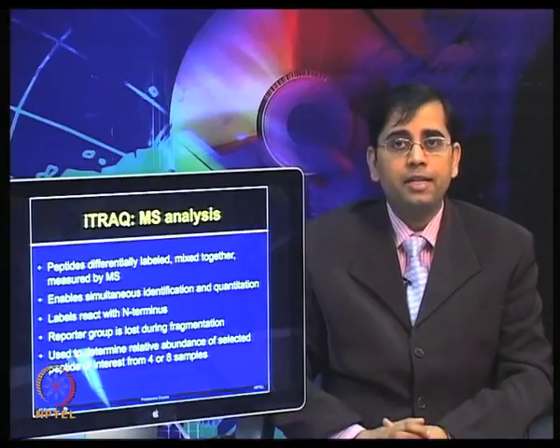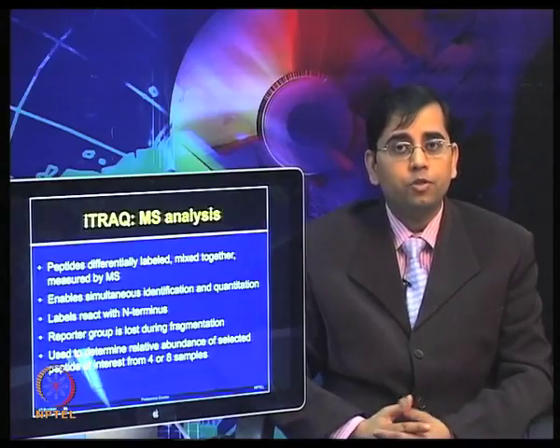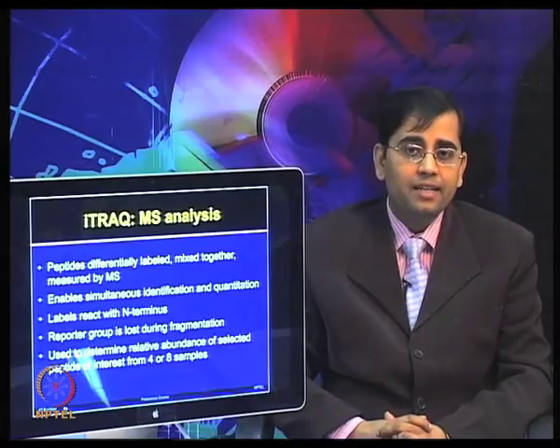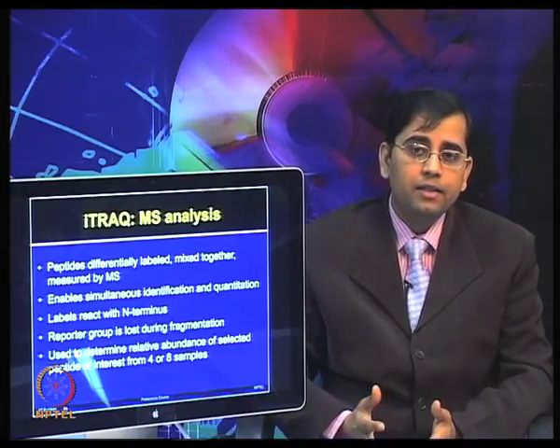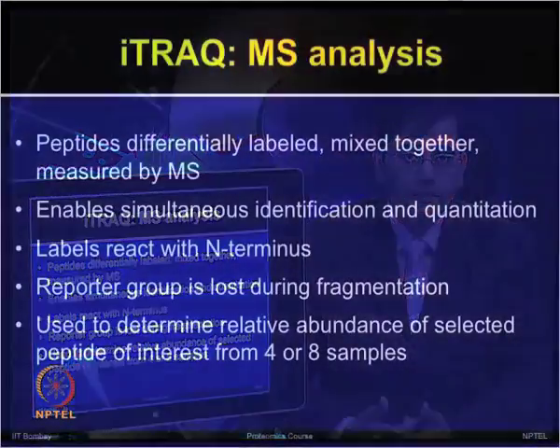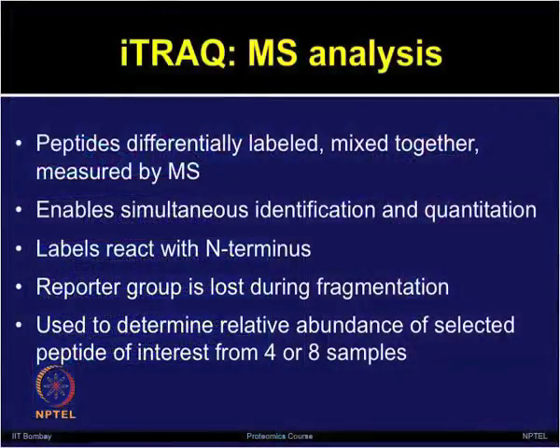Once the sample preparation is done, then further mass spectrometry analysis can be started. The peptides, which are differentially labeled, can be mixed together and measured by the mass spectrometer. This method enables simultaneous identification and protein quantification.